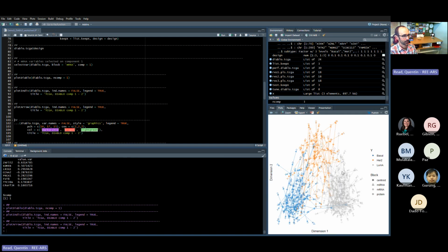Here we see, even though there's some overlap, you can distinctly see the 3 clusters of cell types there. So even though some of them overlap, there's pretty close agreement. Each omic is classifying the samples in more or less the same way. Especially the gray ones. That's the one that was most strongly associated with the first axis. So these ones have shorter arrows, it looks like.